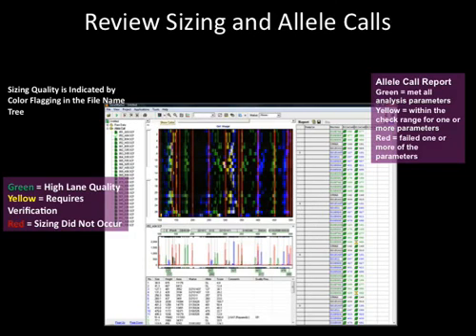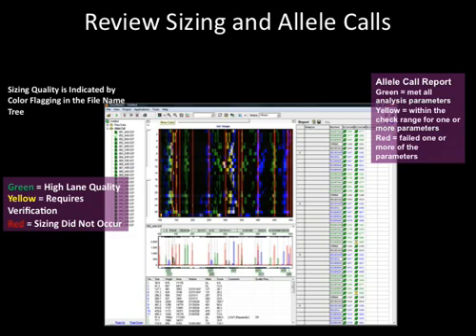Typically, a project with 96 files will process in about 15 seconds. The main analysis screen displays the analyzed data. The allele report table on the right has allele calls with labels flagged with green if they met all analysis run parameters, yellow if the peak was within the check range for one or more parameters, and red if the peak failed one or more of the parameters.